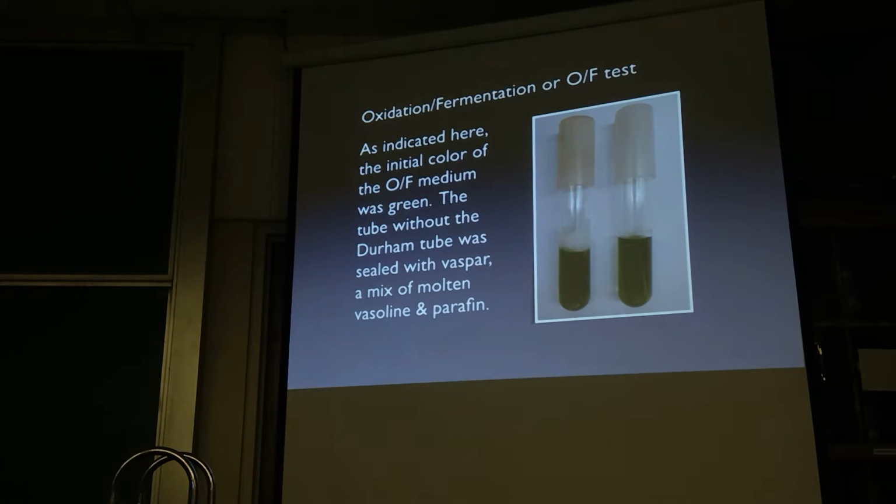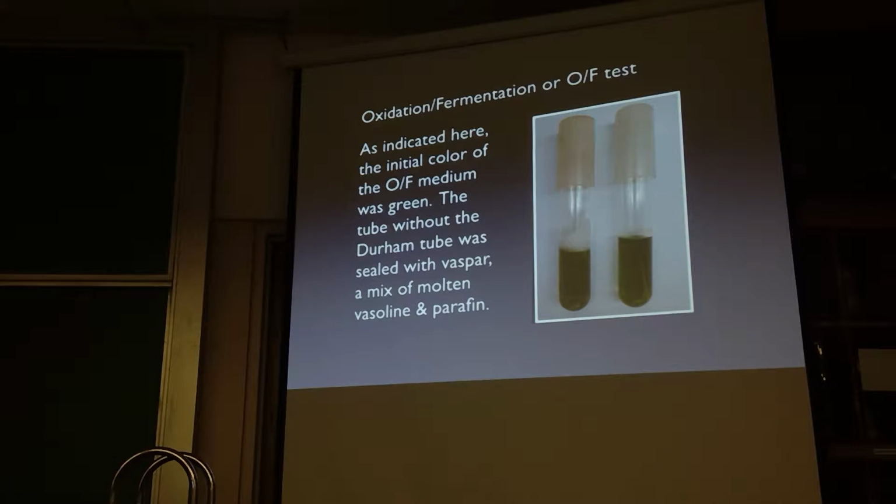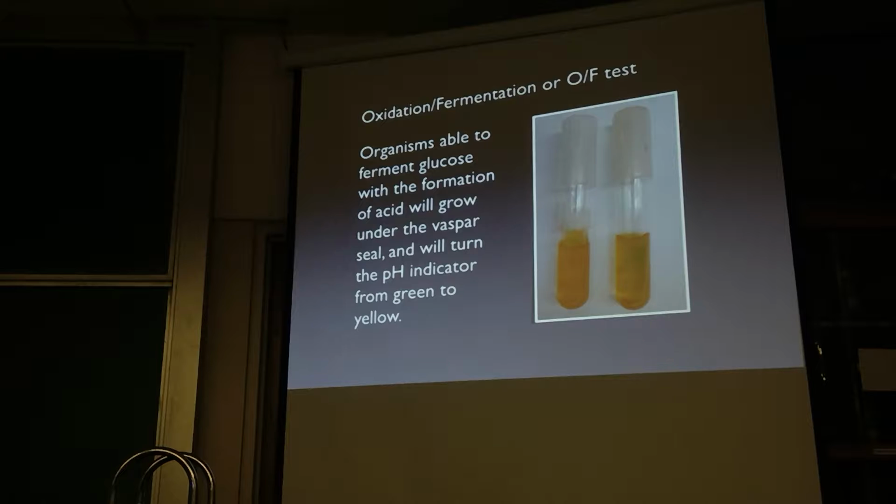Which reminds me, culture number 16 and culture number 25, I pulled those tubes out. They were not supposed to go into the incubator. Those guys are supposed to be grown at room temp. So they spent the weekend in the box. Anyway, don't put them in the incubator.